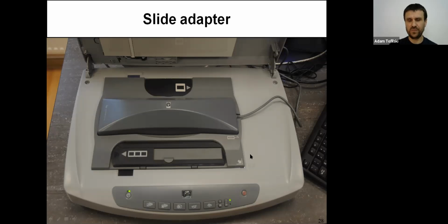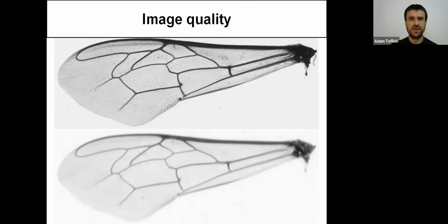When you prepare the scanner this way, you only need to choose in the options that you scan slides or diapositives, and you should use the maximum resolution, but optical resolution, not interpolated. In the case of this scanner, the maximum resolution is, as I remember, 4,800, which is good enough.